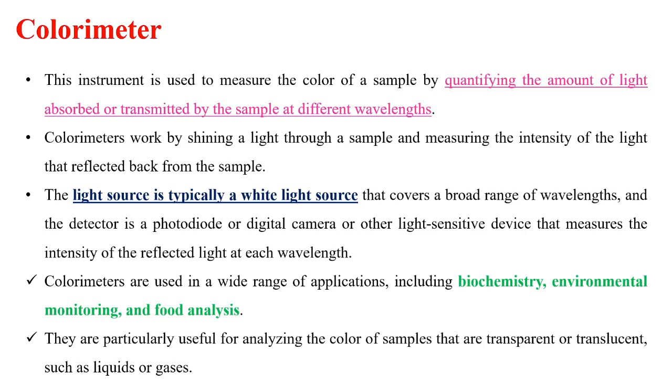We will get to know more about this when we study UV visible spectroscopy. In simple words, if you want to see any reflective thing, suppose this is an opaque object, some light is coming from my back, falling on the object and reflected to my eyes, so I am able to see this object. I am seeing basically the reflected light. So in reflective spectrometry, the detector and the source of the light are on the same side of the object.